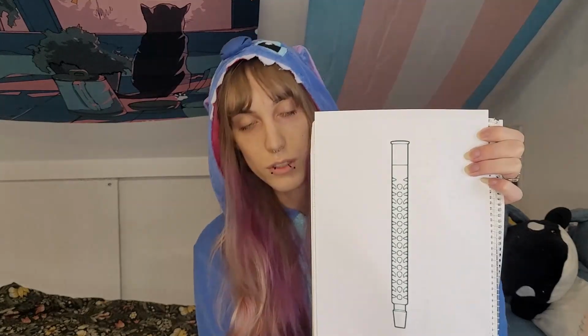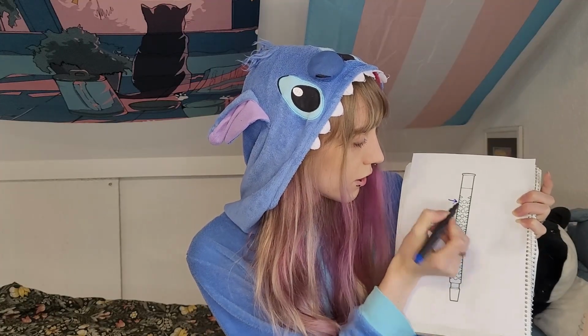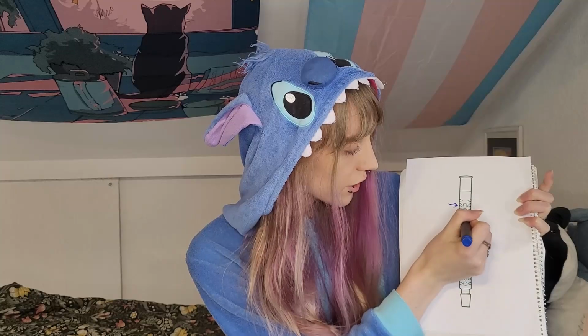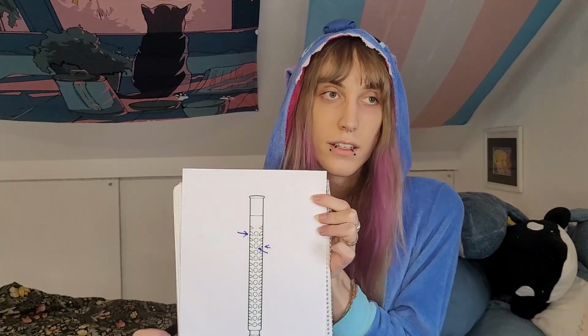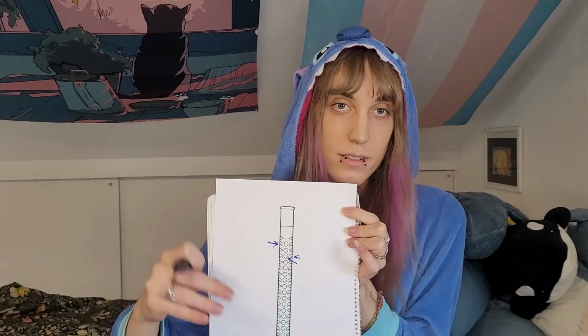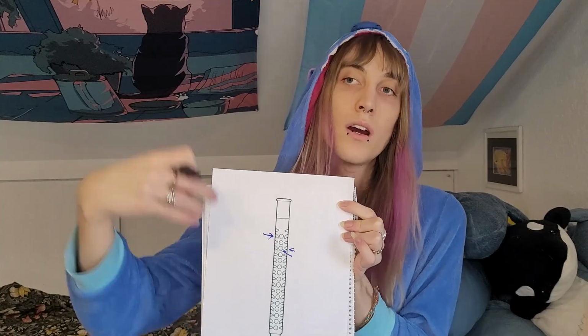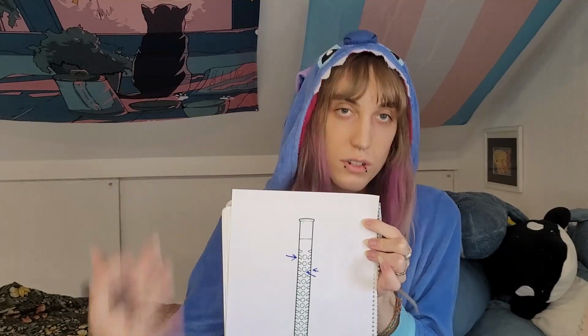And I have here a rough sketch of a Vigreux distillation column. This is just a picture from Wikipedia. And as you can see, it has these little spines all around on both sides, and these are on the front and back. And what those spines do effectively is give the vapor more area where it can condense and turn back into a liquid, drop back down, get heated up again, rise, and so on and so forth.